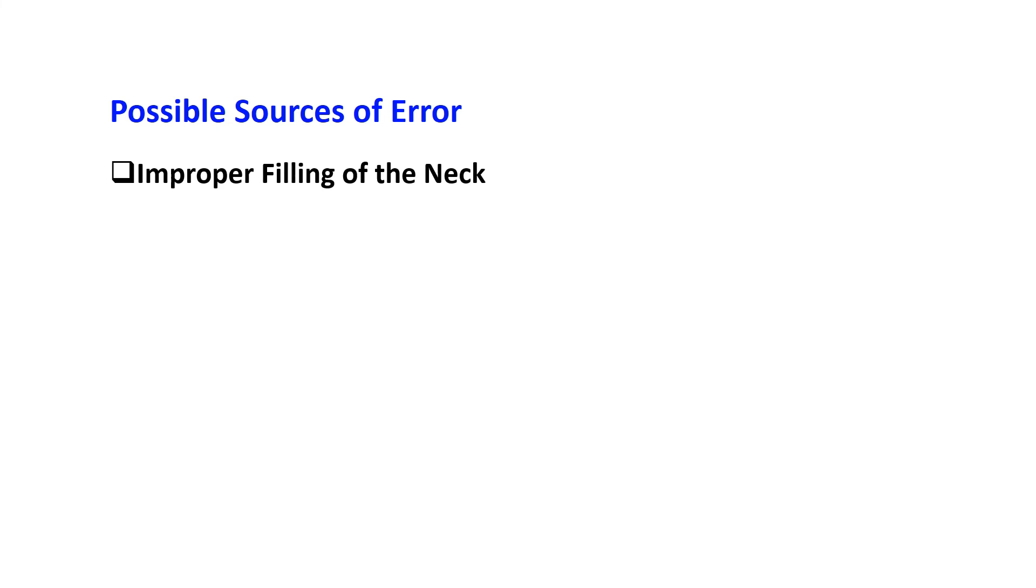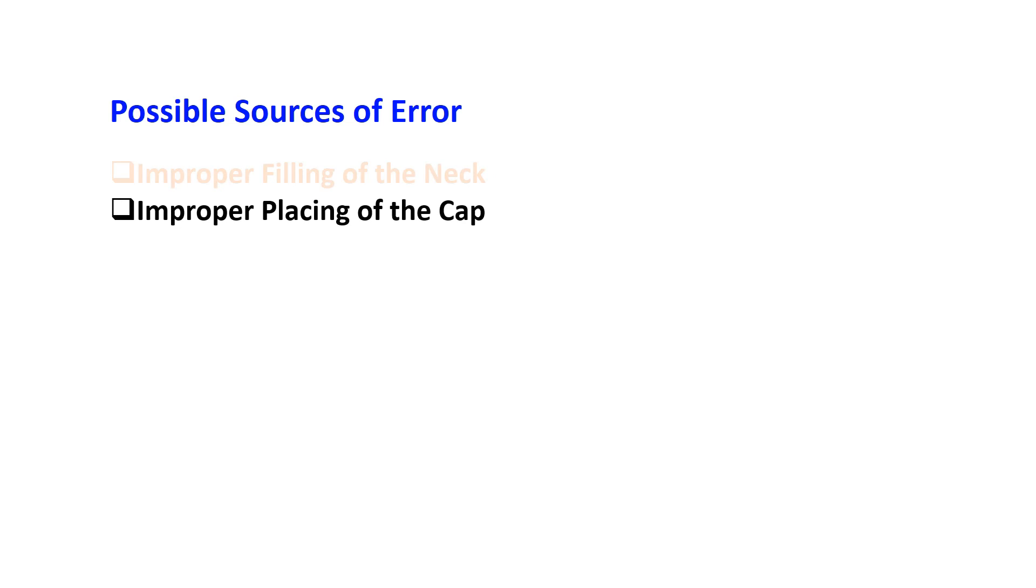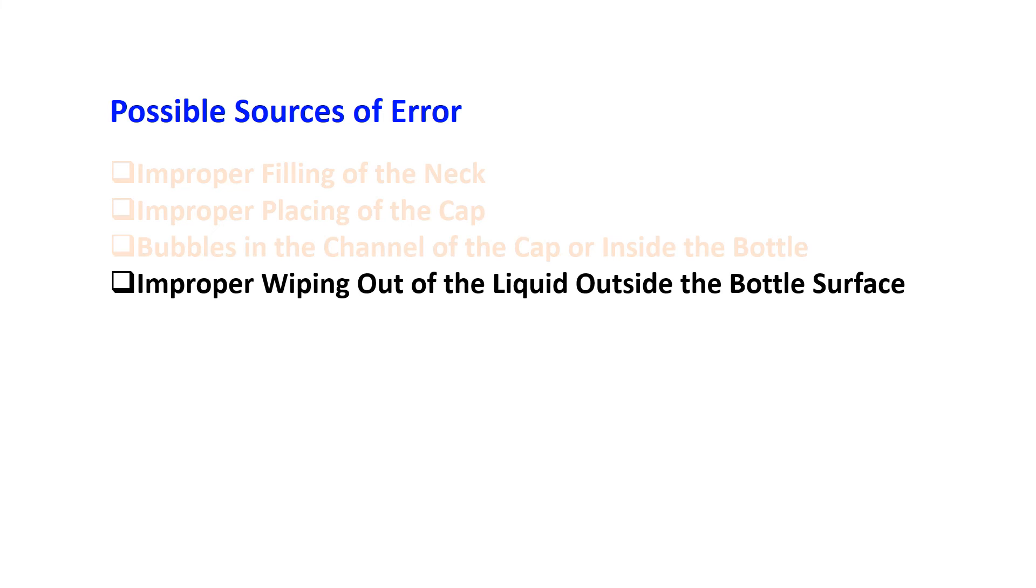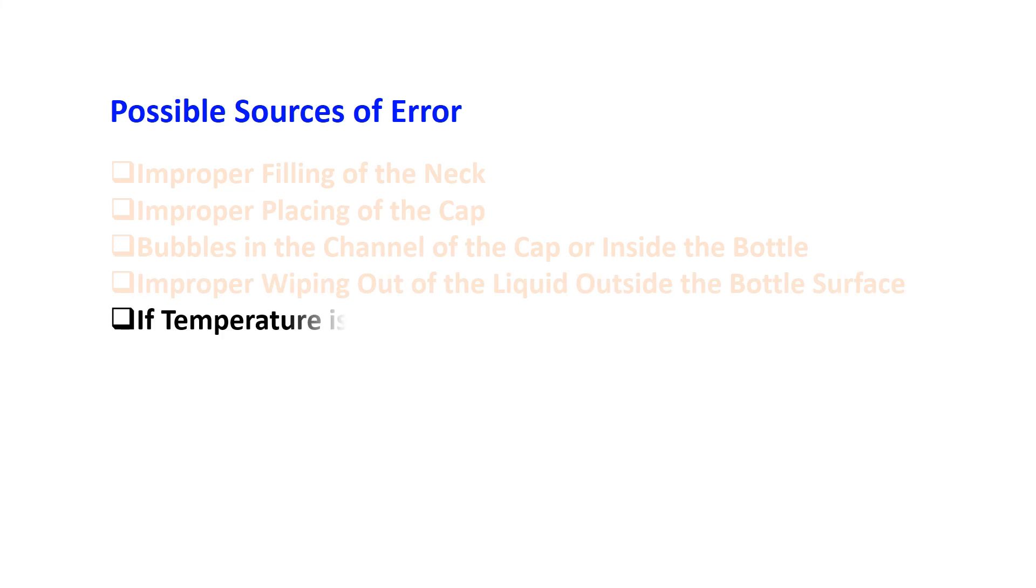The possible sources of error are improper filling of the neck, improper placing of the cap, bubbles in the channel of the cap or inside the bottle, improper wiping out of the liquid on the outside bottle surface, and if the temperature is not at 20 degrees Celsius.